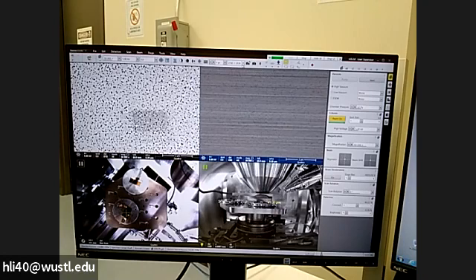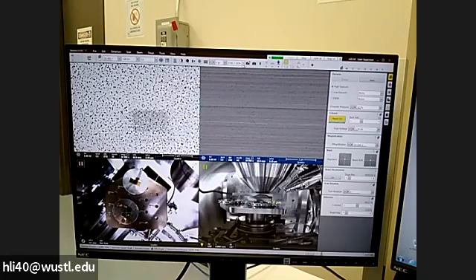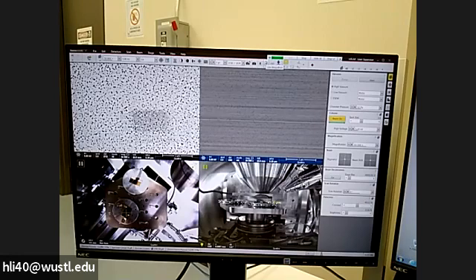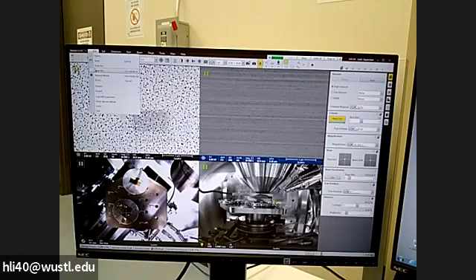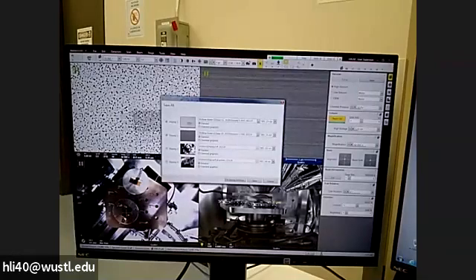All right. Okay, if we like it, we just pause it, or you can adjust contrast and brightness to the amount you like. So after the pause button stops blinking, we just go to save. Okay, select save all. Now we just need to change this.